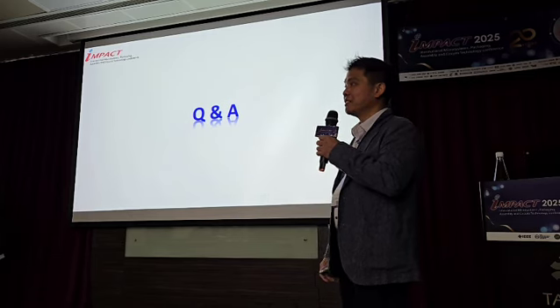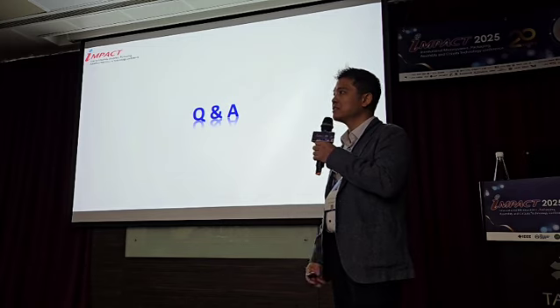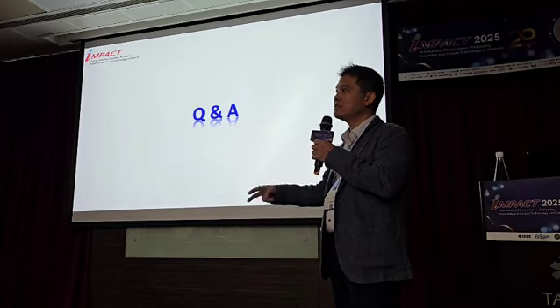So how about its spatial resolution? Spatial resolution, we're looking at submicron on the lateral.